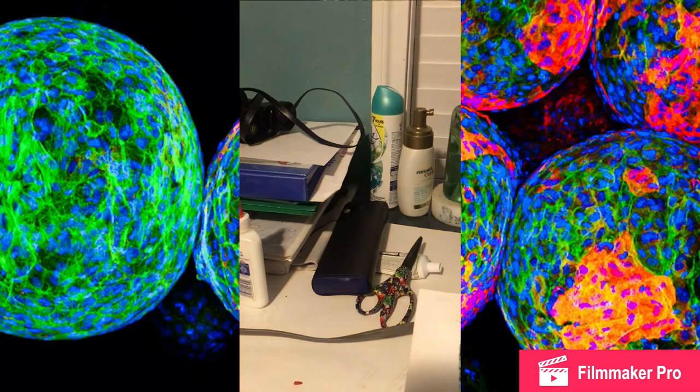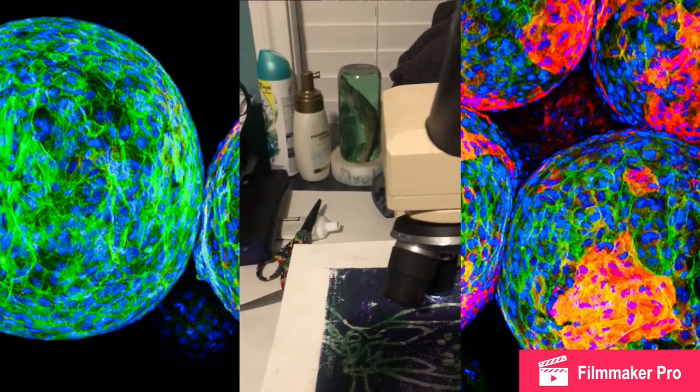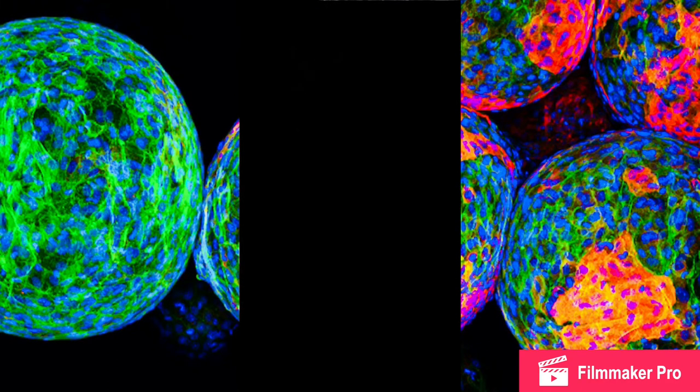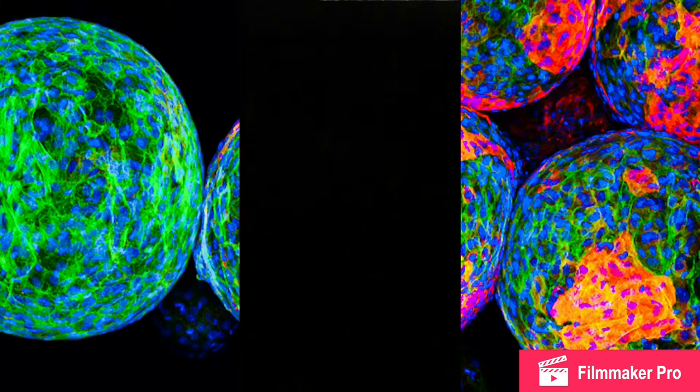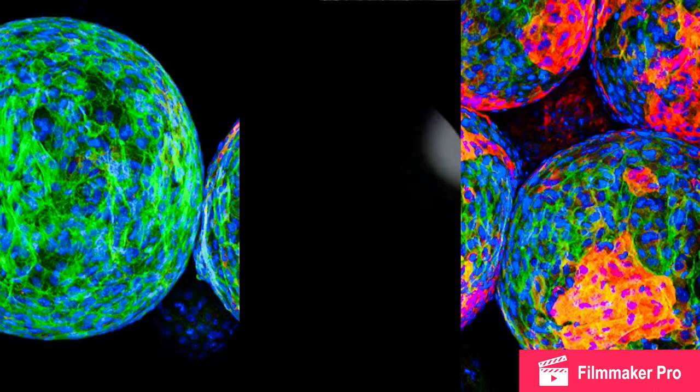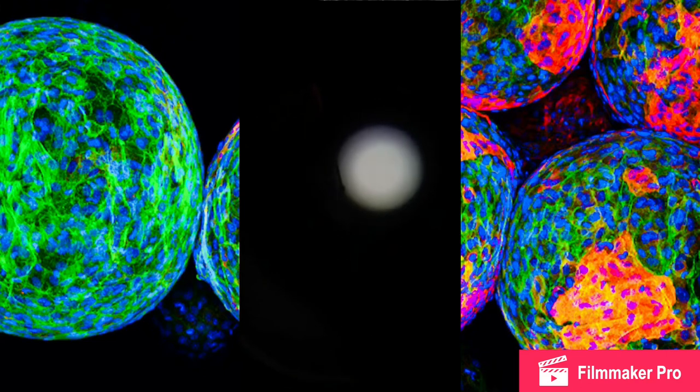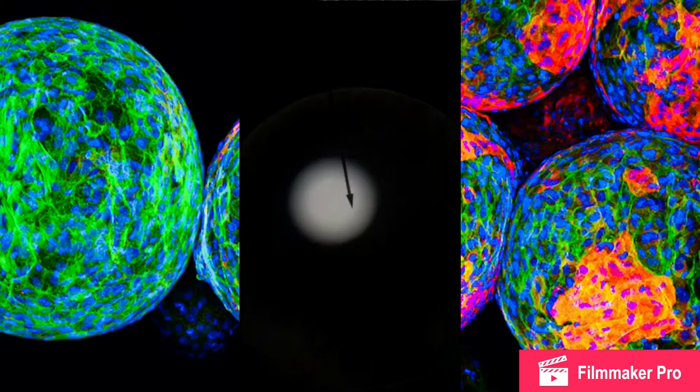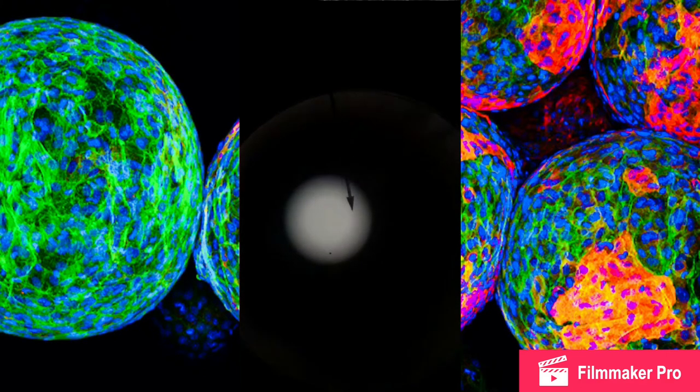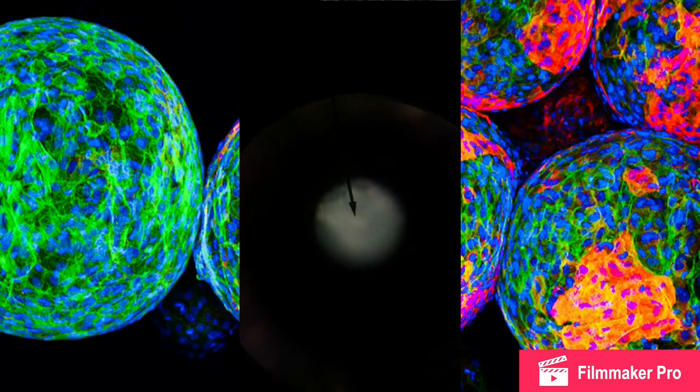Let's zoom in again. Let me zoom out—I'm not sure if anything's going to appear. Let's see... I don't see anything. Yeah, I don't... whoa.